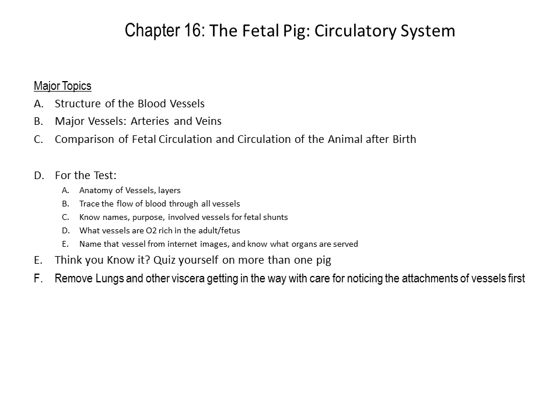And eventually you're going to take out the various viscera today, take out the guts essentially. But before you do that, try to find the actual blood vessels that are servicing those structures, because it may not be clearer once everything's out. So practical notes.